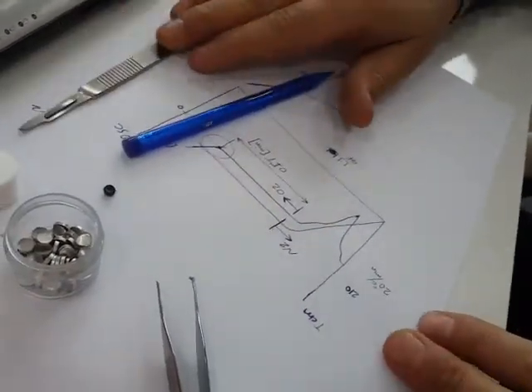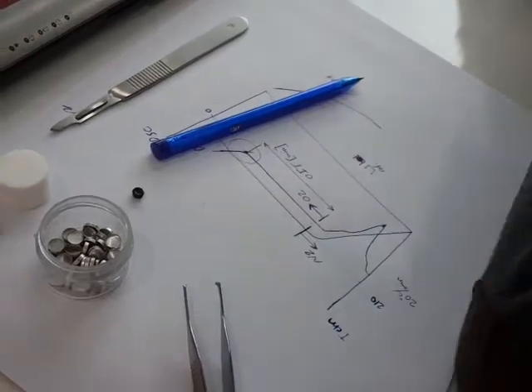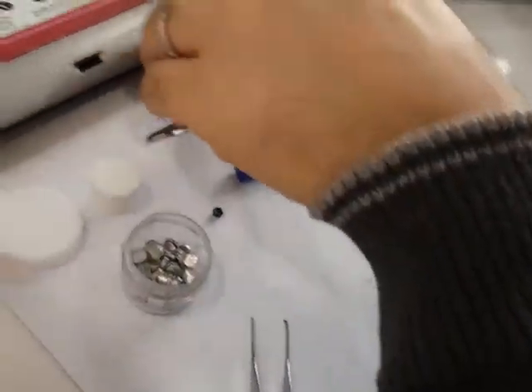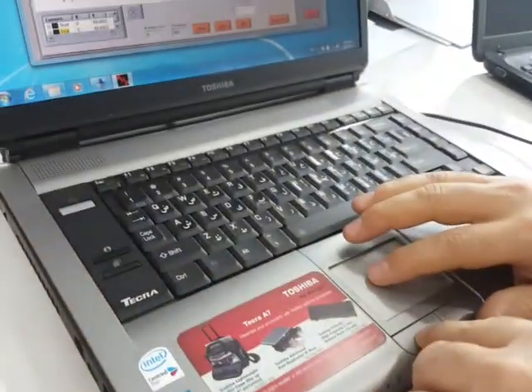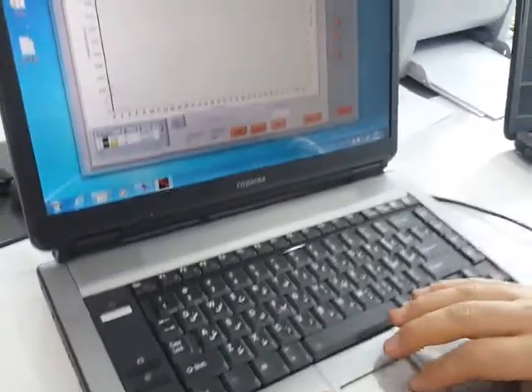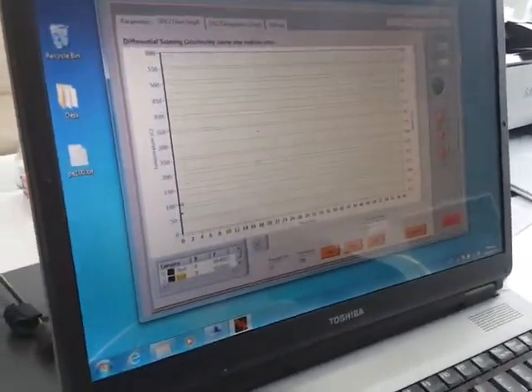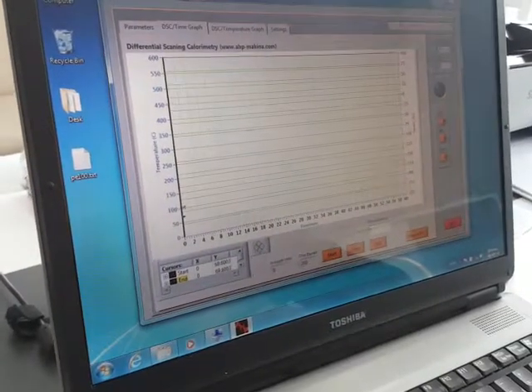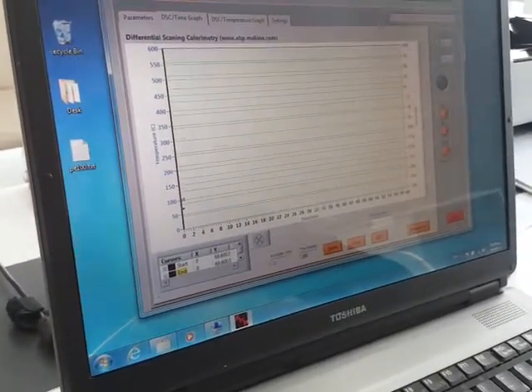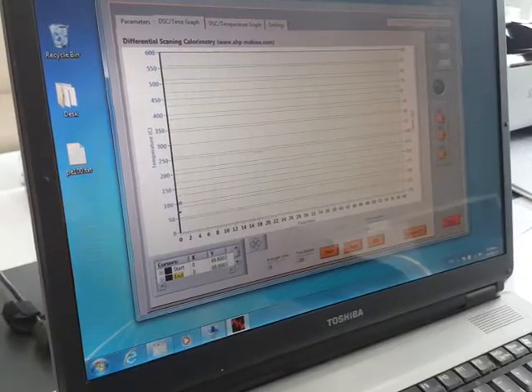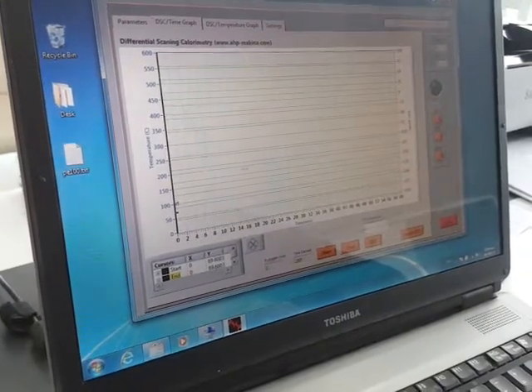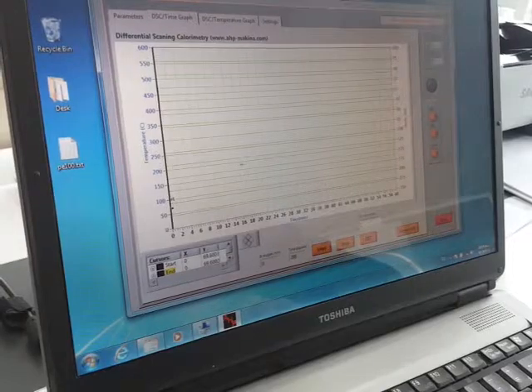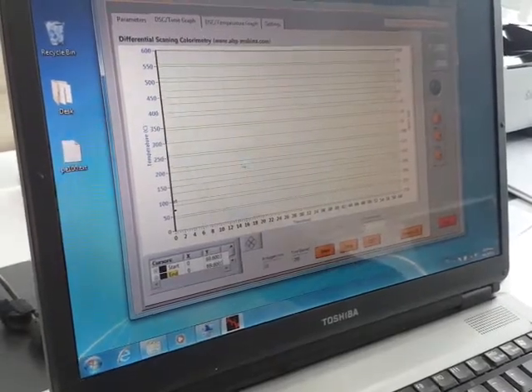After this brief demonstration of the DSC and temperature versus time graph, I will show you how the graph will be received by itself from the machine, and then I will go to the next step. Thank you.